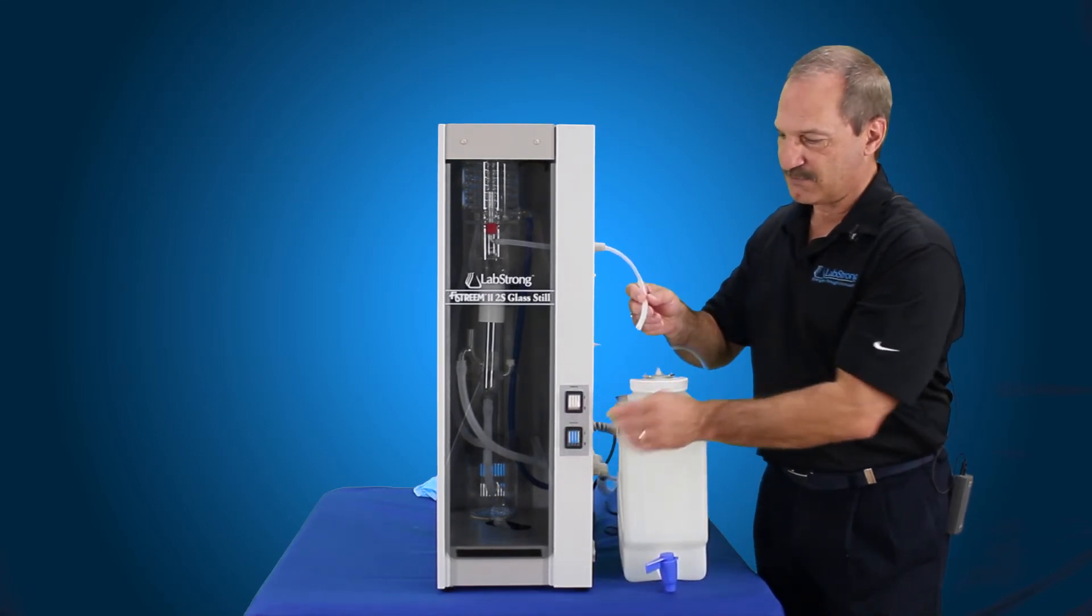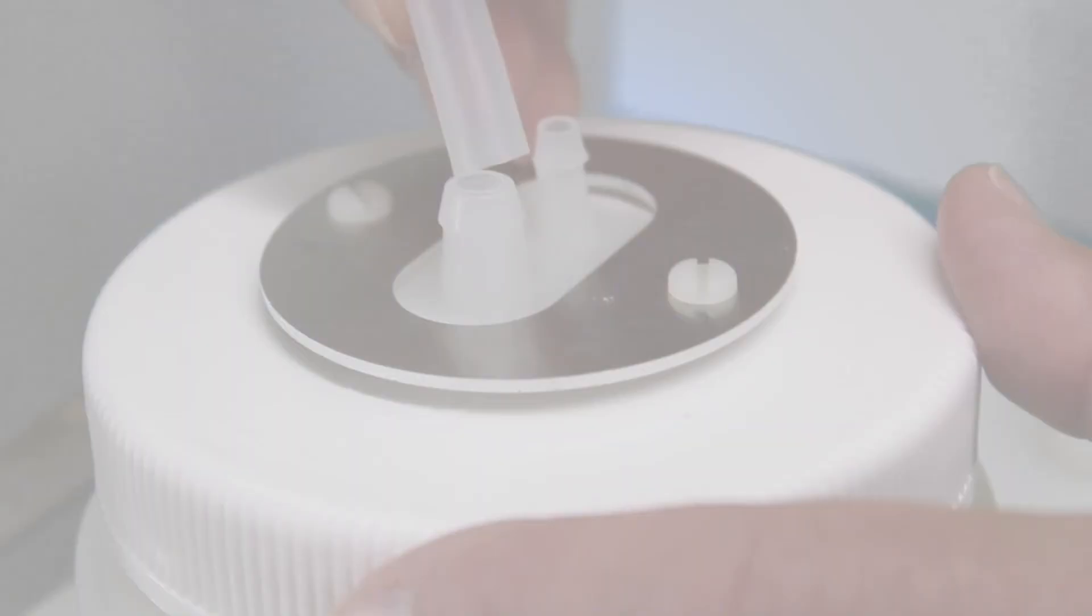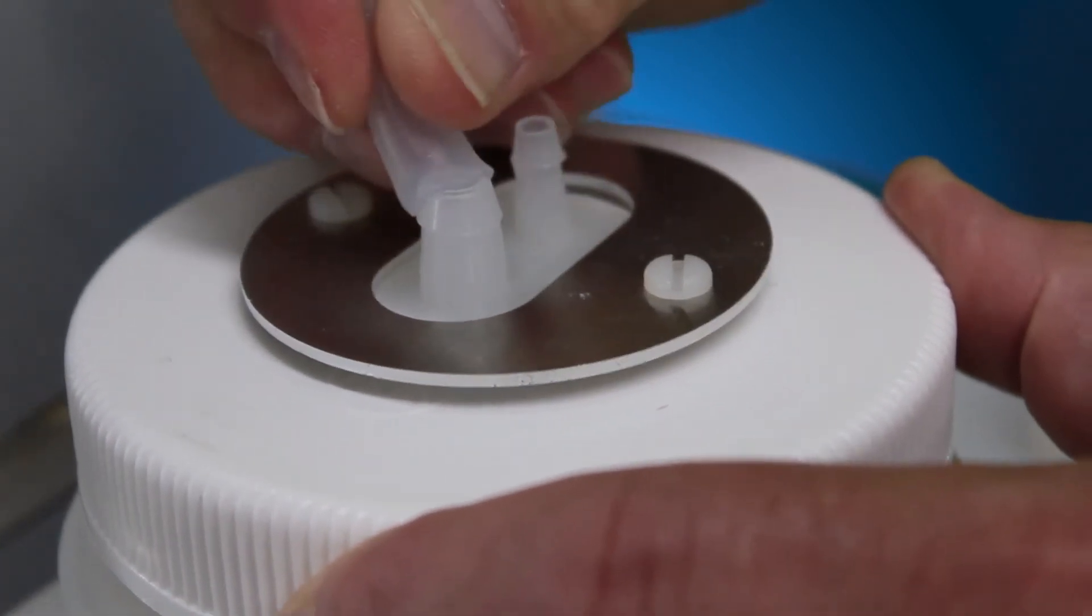But first you want to shut this all off so you stop water coming through here and let this cool down for a little bit because it's going to be pretty hot. Then you want to reconnect it up to your tank after you've run that four or five liters to drain.